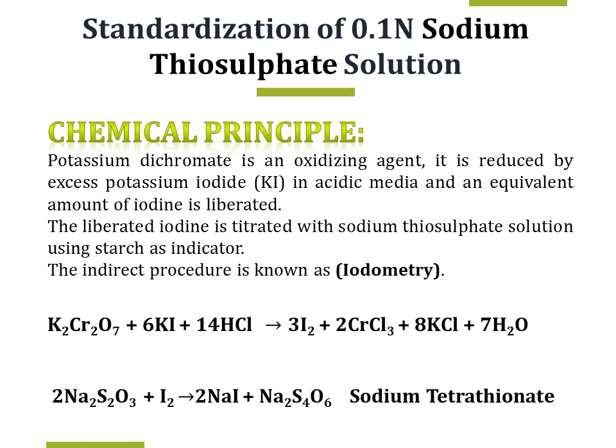Potassium iodide is a reducing agent. Hydrochloric acid provide acidic media for redox reaction. And standard solution is 0.1 normal sodium thiosulfate solution. والindicator اللي راح استخدمه بالstandardization is starch.